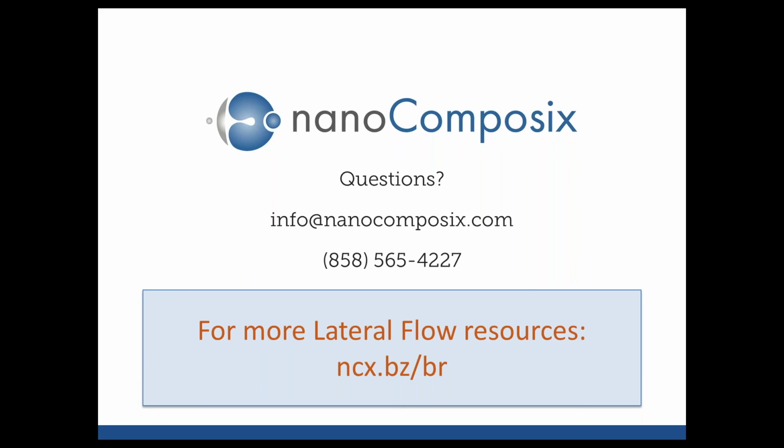Again, that's something we empirically test for each assay. That can vary from proteins like BSA, casein. Occasionally we use fish skin, gelatin, and there are some other synthetic blocking agents that we found to be a little more reproducible from lot to lot from the manufacturer. There are a whole slew of blocking agents that are out there commercially available. So I typically would recommend screening as many as you can while also considering the cost.